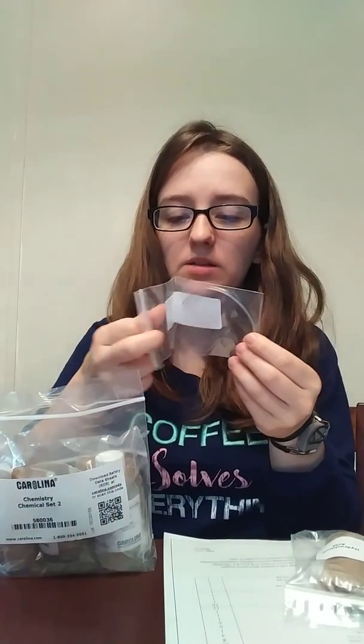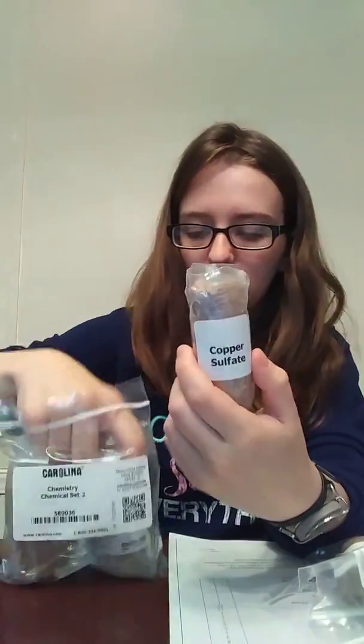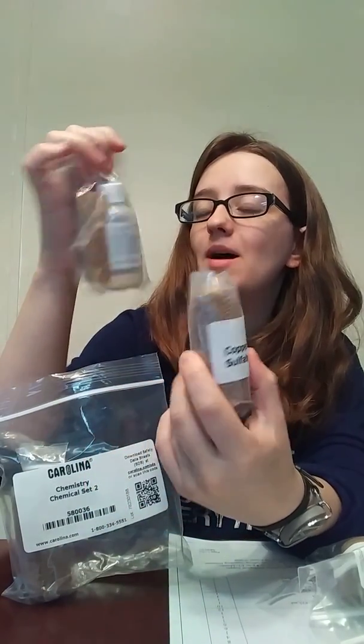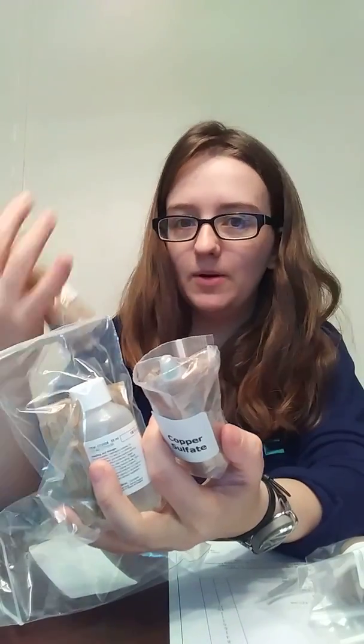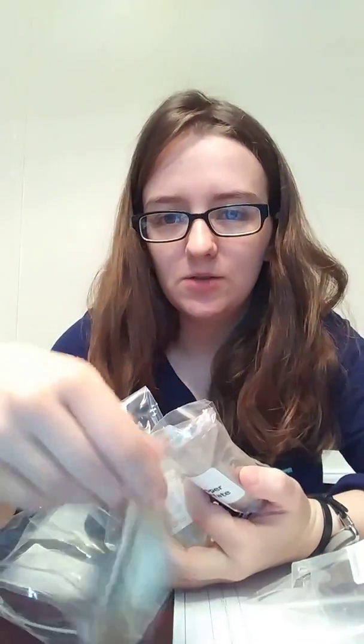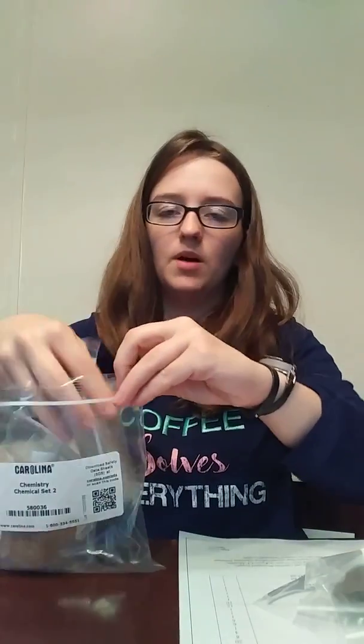Chemical set two has hydrochloric acid, magnesium metal ribbon — you can see it there, it's really thin — copper sulfate, sodium hydroxide, and — I'm not going to try to pronounce this one — maybe phenolphthalein? Not sure. This one's a bunch of little boxes and little bottles.